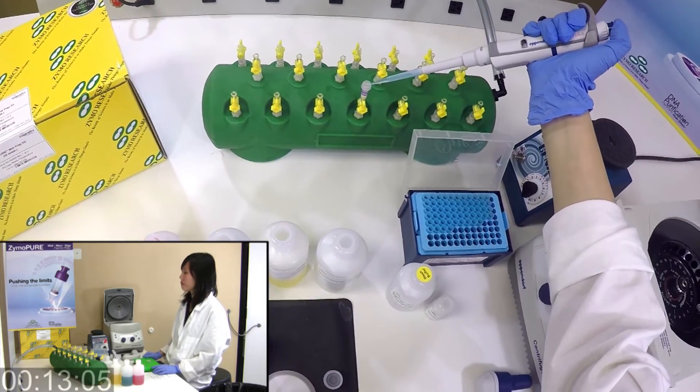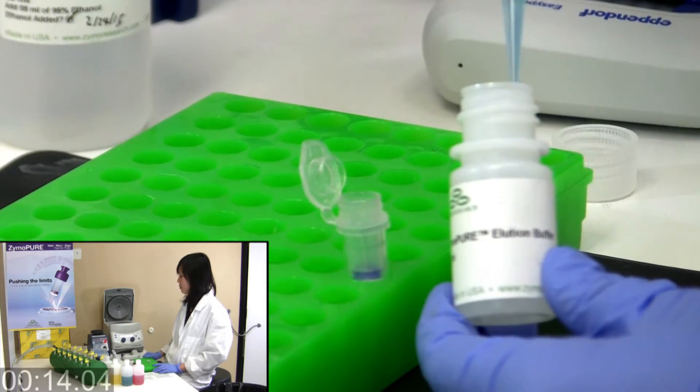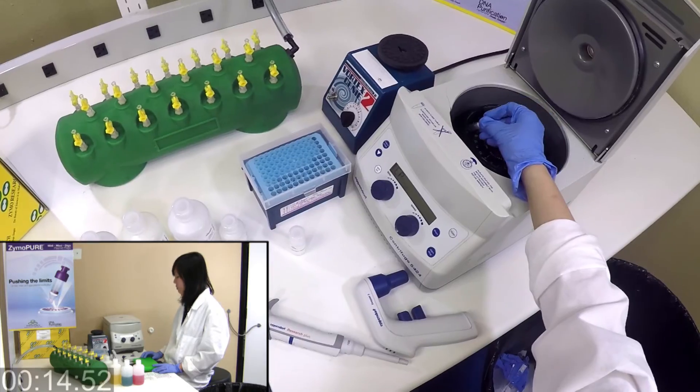Wash for ultra-pure, endotoxin-free plasmid DNA. Elute your transfection-ready plasmid DNA directly from a column using a microcentrifuge.